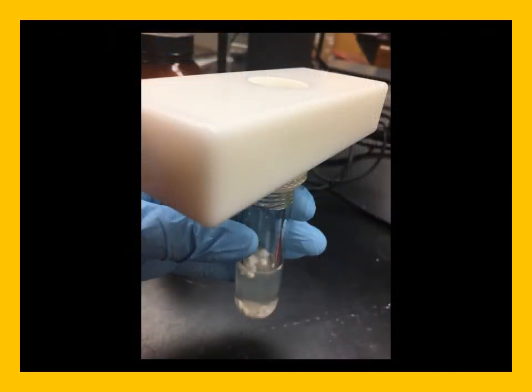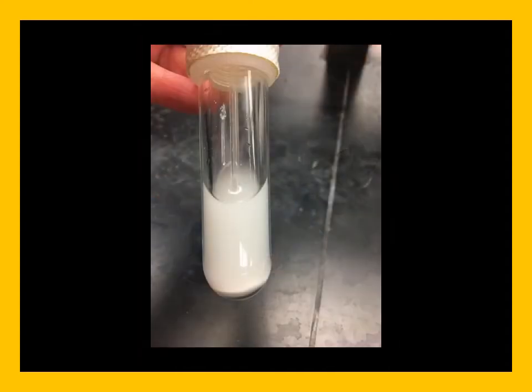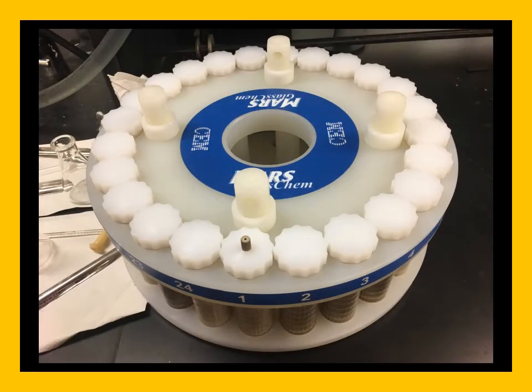In order to completely seal this, we're going to use a little tool to make sure the lid is well ratcheted and of the proper tightness. Now we see that there is a small glass tube. This only happens on one sample, and it's going to allow us to measure the temperature within one of these reaction vessels to control the temperature of the program. And you can see that there's a large amount of undissolved solid. Here is the rack in which all the tubes go on for the microwave reactor, and we've put our sample in which the probe goes into in position number 1.